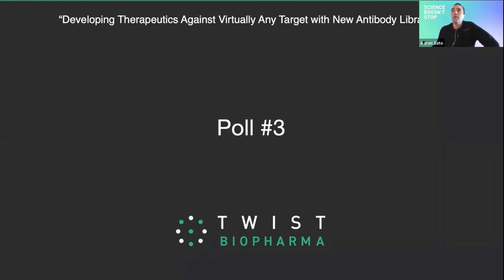Next question. What are the expression levels of clones? Do these constructs express well? Sure. I think he's referring to the IgGs coming out of the library. Yeah, I think that we get lots and lots of leads out of these libraries.